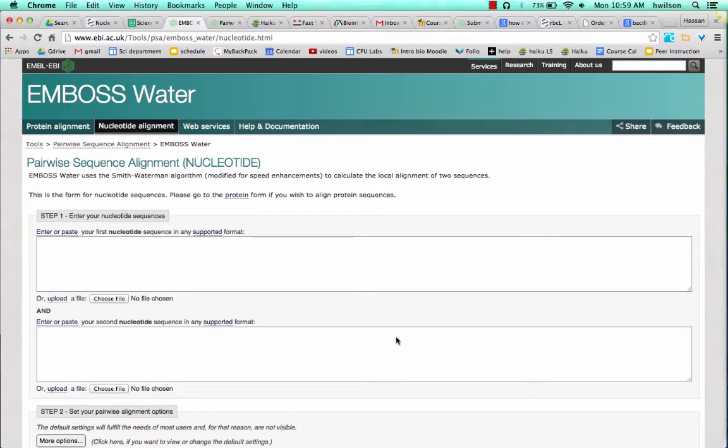I'm going to show you how to align just two sequences and compare them to get percent identities. One method you could use is Emboss Water.